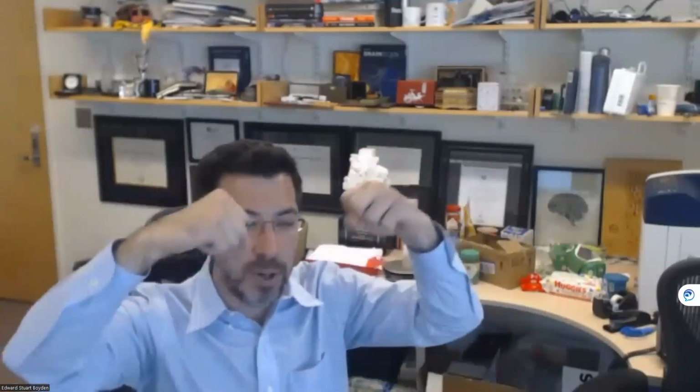My gut feeling is that if an antibody does work well in a Western blot, maybe it works better with post-expansion staining because we are treating the sample with heat and detergent before we expand the proteins apart from each other. But it'd be great if the community wants to make such a database. I mean, we can't afford to test all these antibodies for everybody. I know, but if the community wants to do that as a whole, again, with over 450 experimental papers and preprints, it's certainly something the community could do if it wanted. Yeah, I think that would be something maybe our group can start tackling then, if you don't have that available yet.